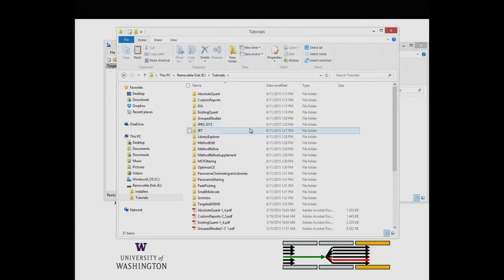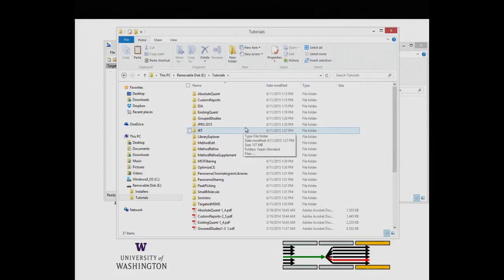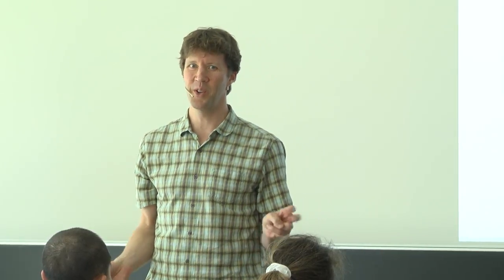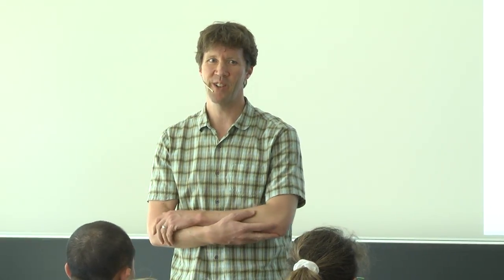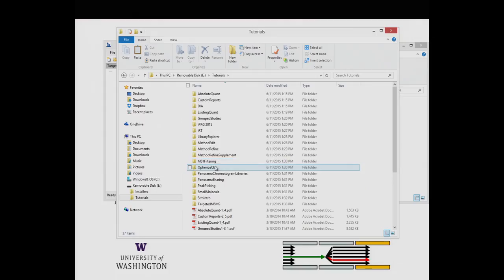And then we have this whole folder full of tutorials, which we got 3 Skyjams this week. This is the first one, and I sort of have preferences on what the other 2 are going to be, but they could be drawn from this based on feedback from you guys after this session. But the first one we're going to do is this group studies one.